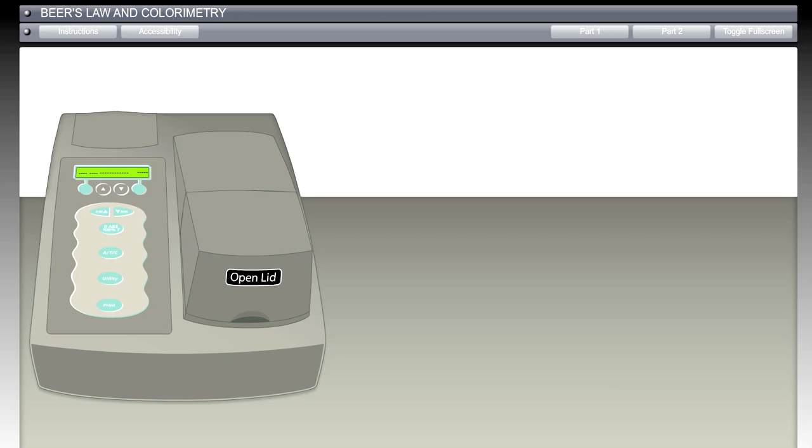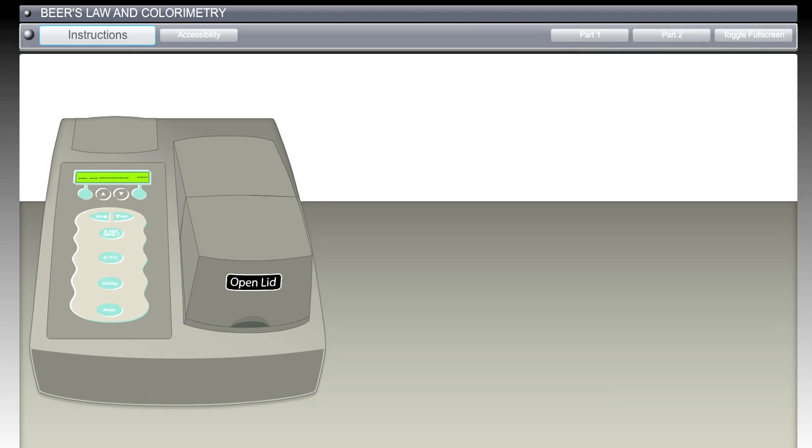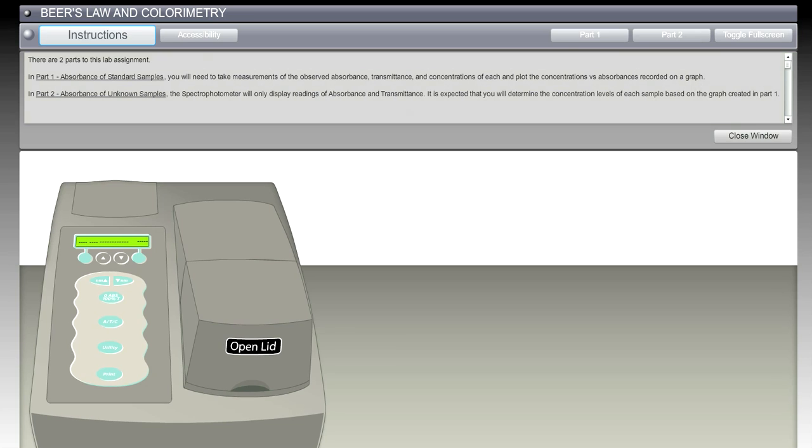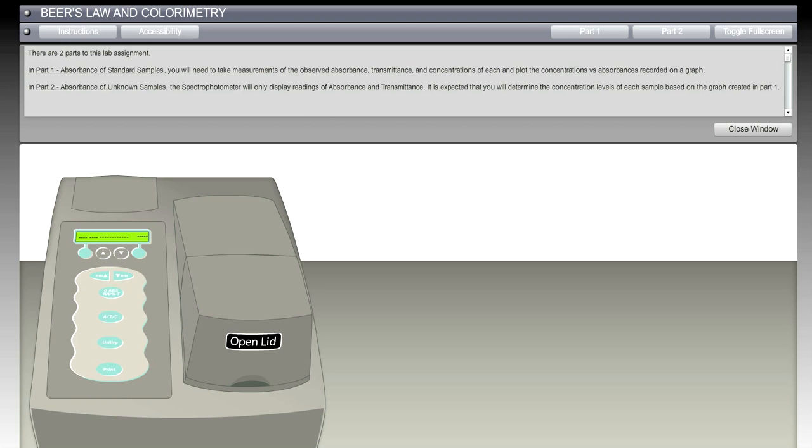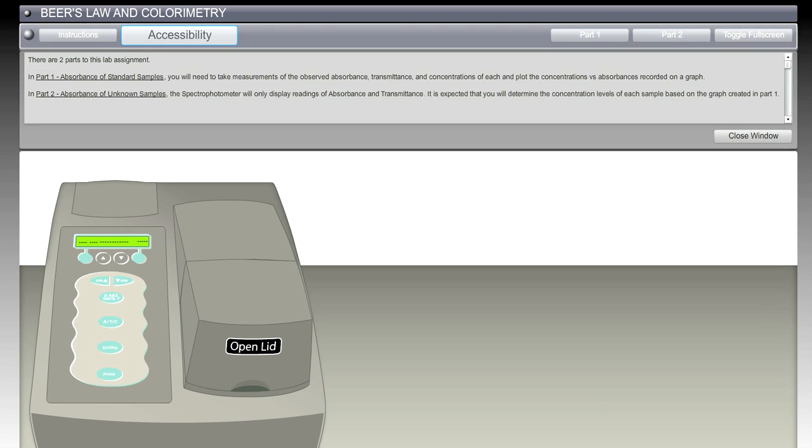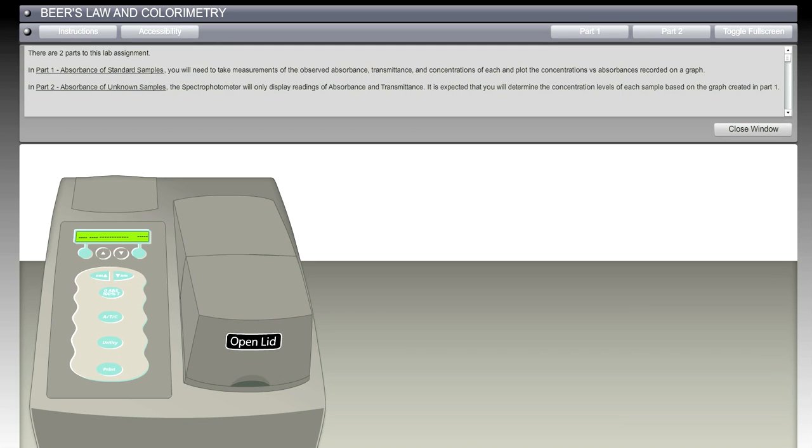Let's point out a few things here. We have some accessibility options that involve interesting transitions and audio. This is an experiment not only for the students but for ourselves in accessibility land. The Section 508 compliance buttons will get bigger as you roll over them and being able to make as much use of the real estate was important.